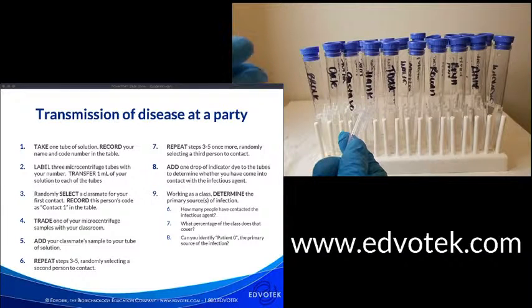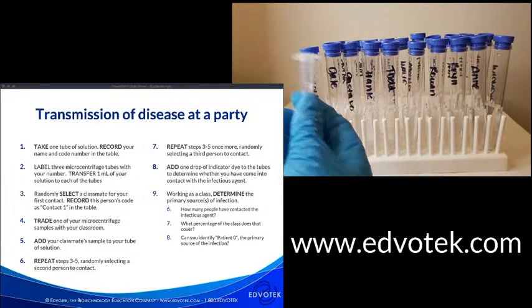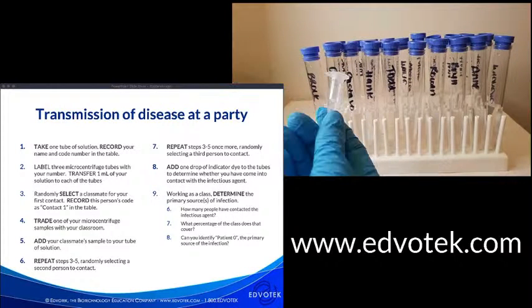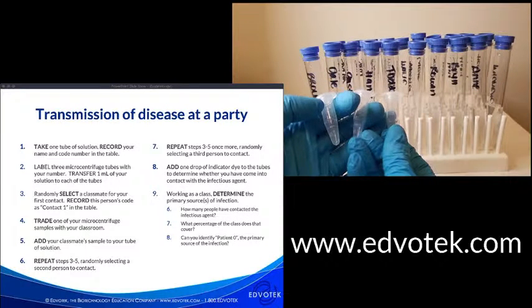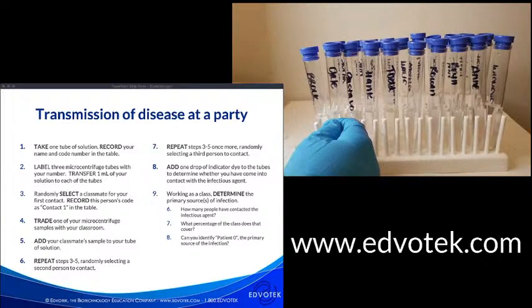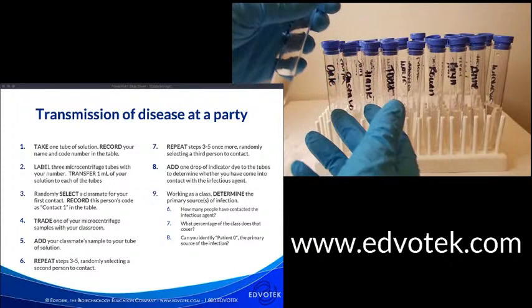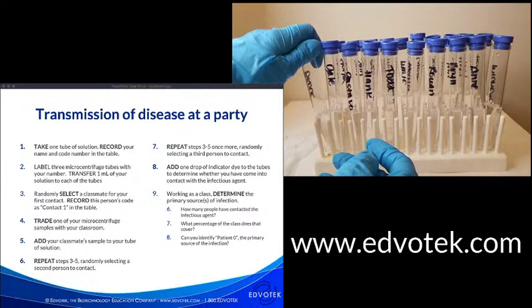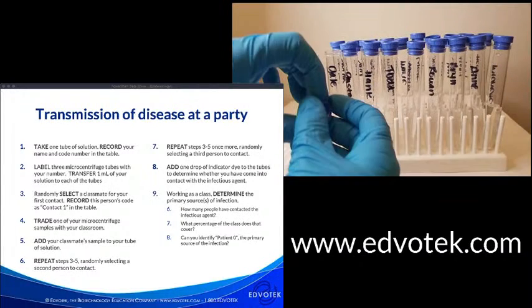So one person has the disease, they contact people, and that virus isn't able to replicate in their body in the short time that they're all together. And so your student gets their 3 tubes, they empty their 3 tubes into their 1 tube, cap the tube, and flick and invert to mix, because we want to mix the samples from all 3 of the students' contacts plus their own sample together in their tube.